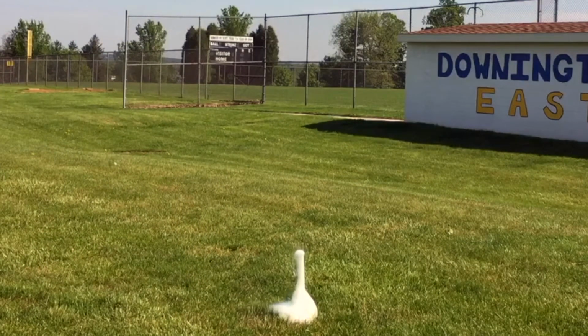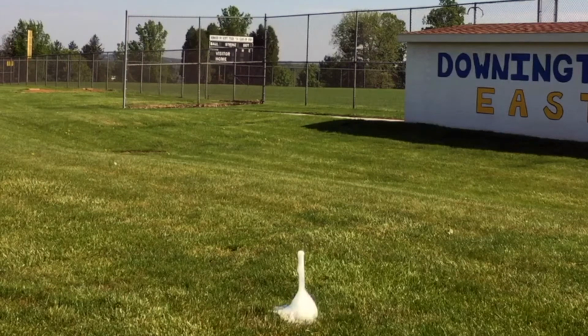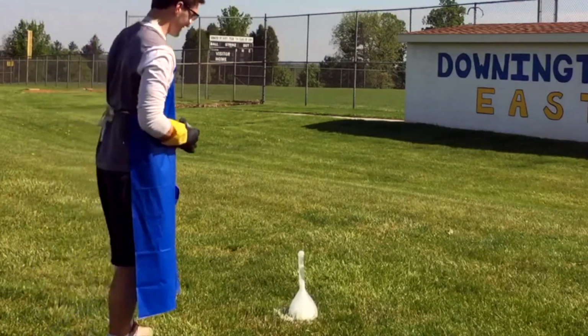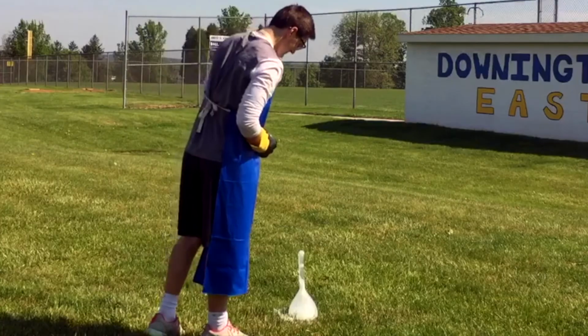No! What? That was horrible. What happened? That was anticlimactic. It really was. We have to do a second trial. There has to be a second trial. Potassium iodide? We know that. We didn't ask you to come out here. You failed. Don't you remember when you said this is going to be major? Yeah, I promise it's going to be major. Not like the other times when I say it's going to be.